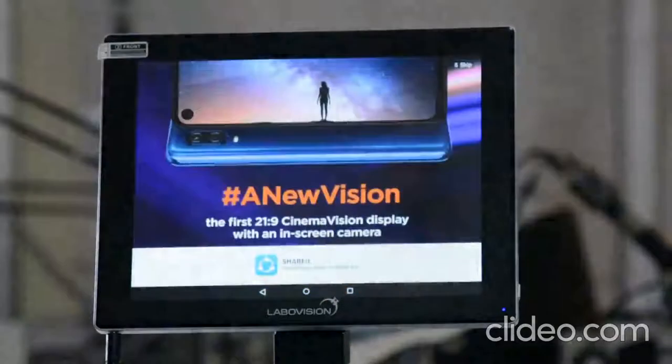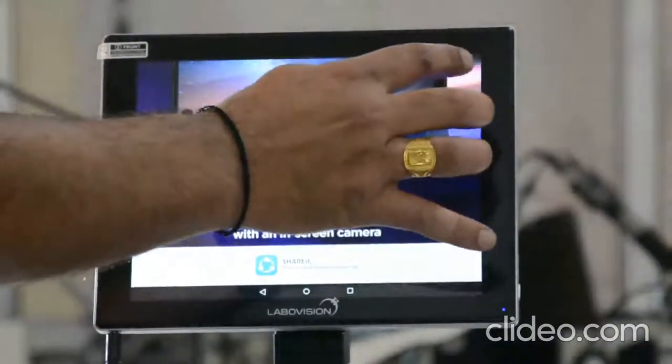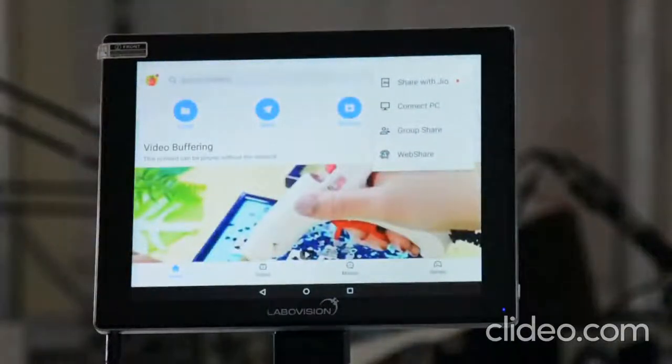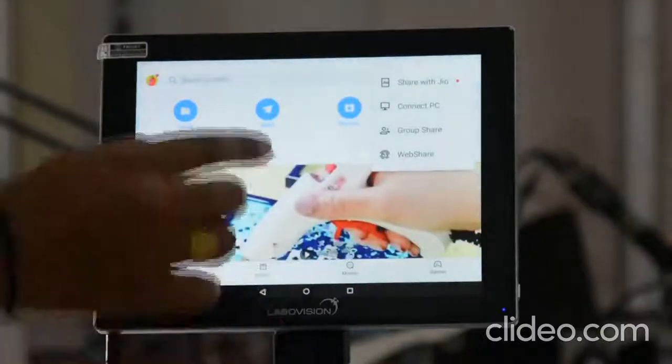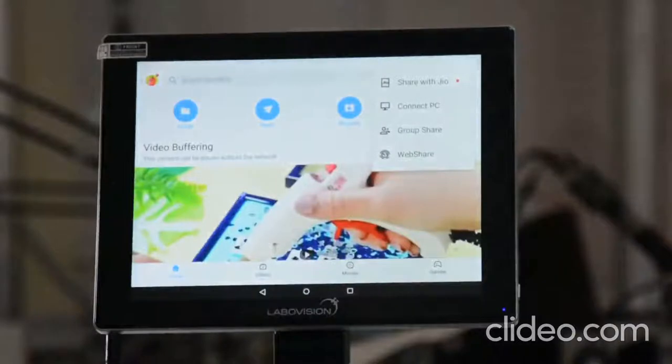Now there is Share It which has already been given in the LCD screen. We have preloaded the same software for you. Now you can share to your fellow members, to your fellow students, or to any research colleagues.